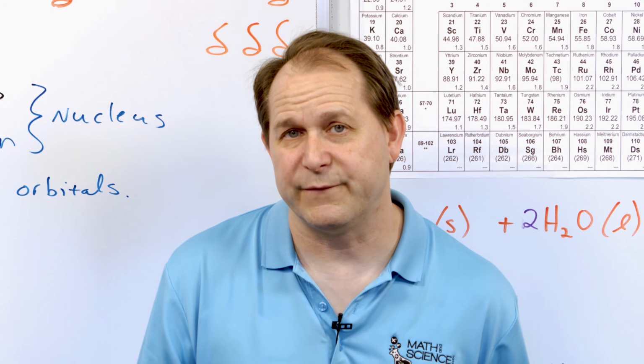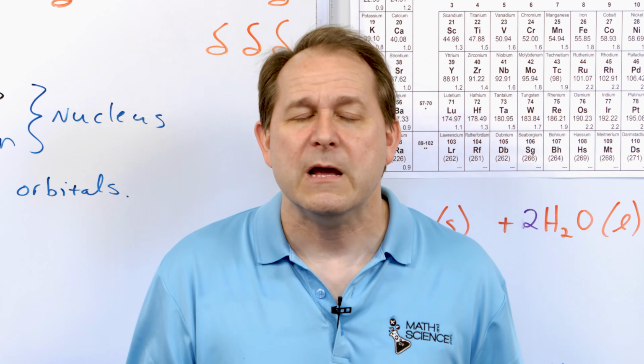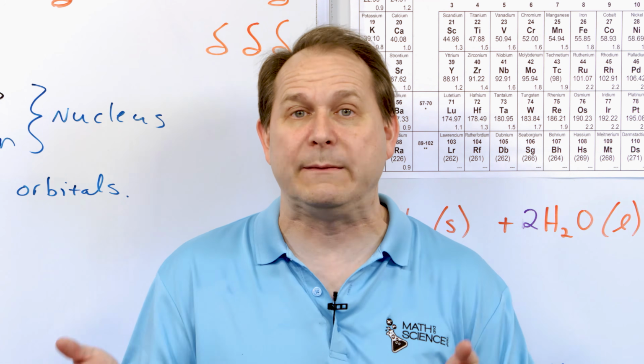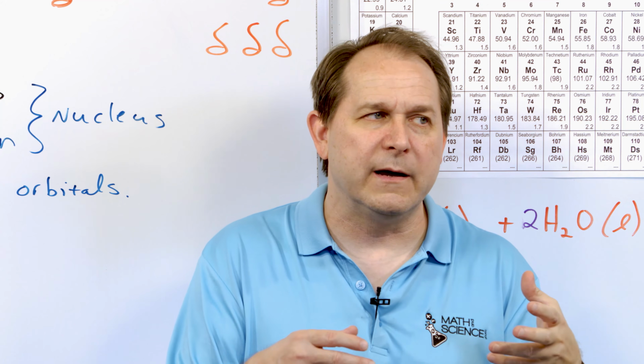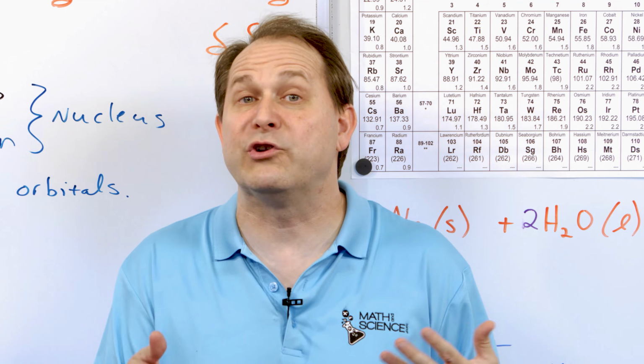And the other main difference is that the color of the combustion was a little bit different for the potassium. The hydrogen burning itself is always a pale blue, and we see that in both the sodium and potassium reactions. But when we look at the sodium, you see these orange flame colors, and for the potassium, you see a little bit more muted purples and even greens.